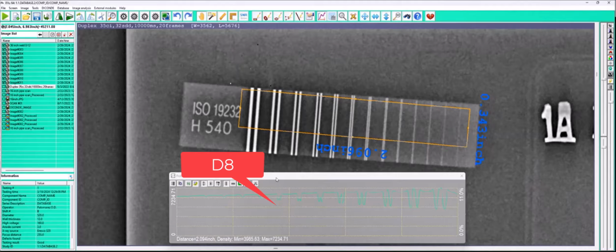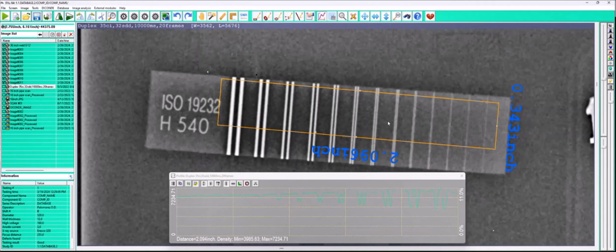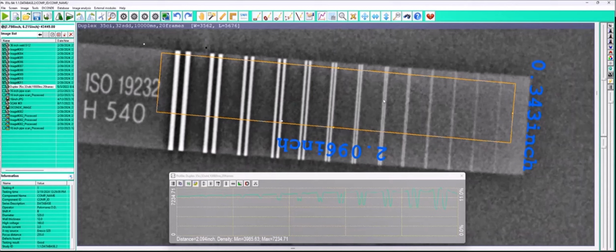That's the width. You can kind of see, and this is a visual inspection, a lot of space between this first line, second line, third line. Everything looks good till you get to about 7. You can still see the space, and then 8. Yeah, it's kind of hard to call 8 here, right? There's no real definitive straight black between the two lines.